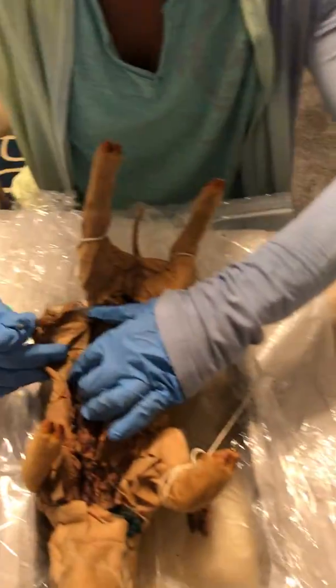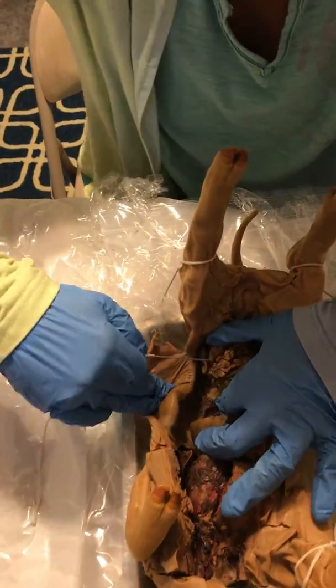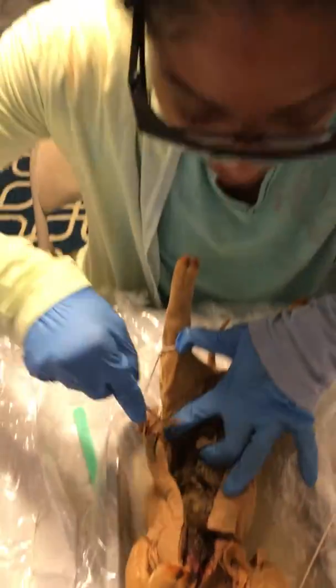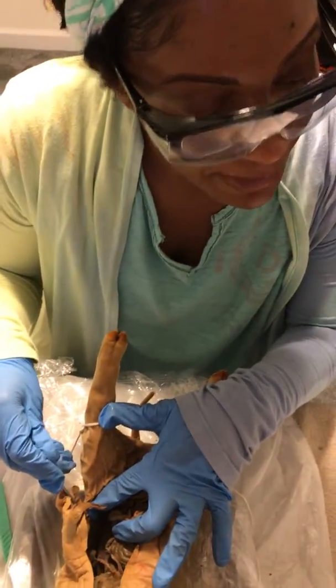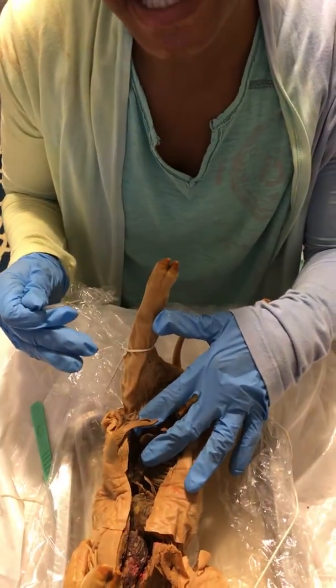Okay, our last dissection. The kidneys are retroperitoneal. They lie on the dorsal body wall. And the adrenal gland would be near the cephalic end of the kidney. The ureters are a muscular tube beginning at the hilum of the kidney.